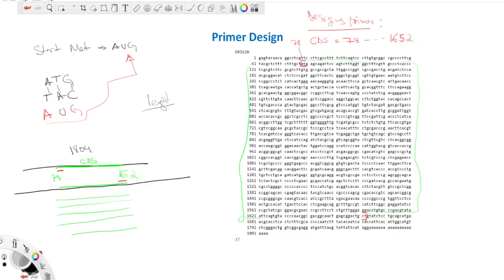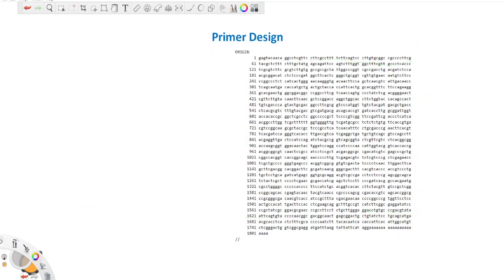I've already done it for us, and you can also do it in your own time. My first region here, if I remove this and create a clean one, I've selected from my ATG about 20 nucleotides, which is this full region. So I went with it like this.